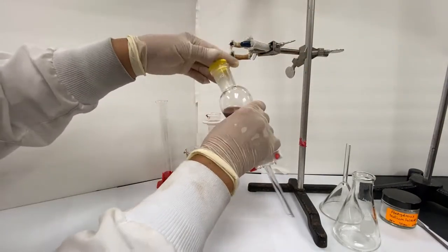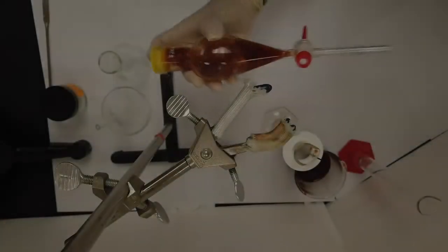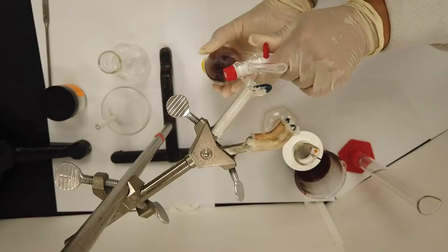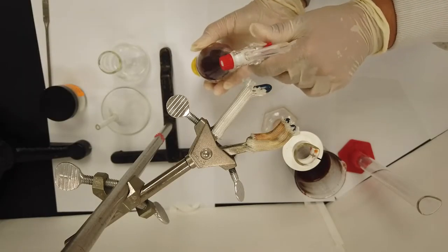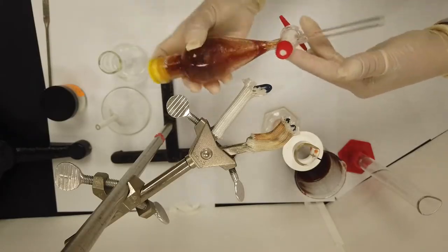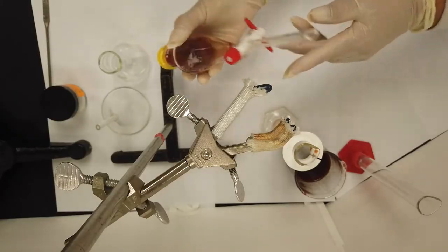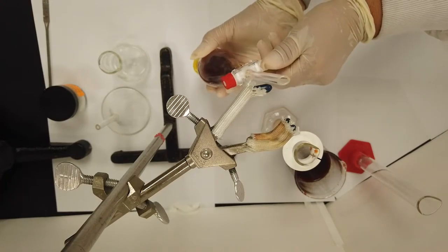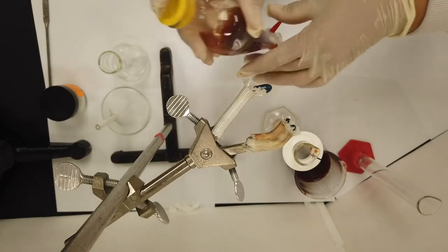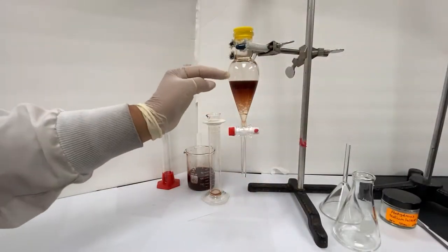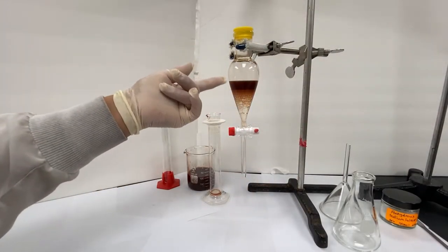Turn the funnel over and slowly open the valve. As you can hear, shaking causes a buildup of pressure inside the funnel, and venting it allows the excess gases to escape. You may repeat this several times, which may lead to a higher final yield. Once you're satisfied, you can replace the funnel on the stand and wait for the layers to separate.